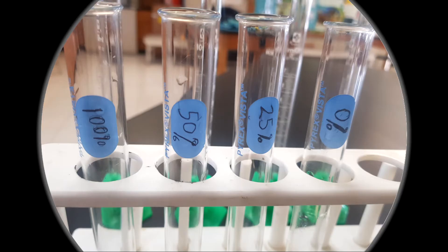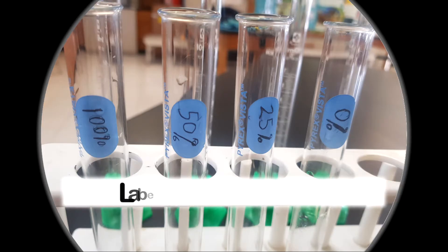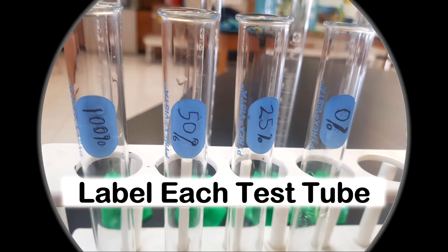The first thing you want to do is label your test tubes. I label mine in terms of the percentage sugar concentration I'll be using. You can label yours in terms of numbers — one, two, three, four — or A, B, C, D, whatever you prefer. But I like to label according to what I am using.